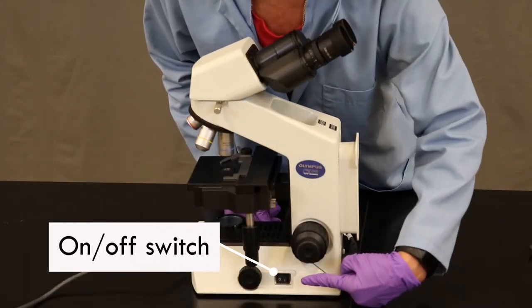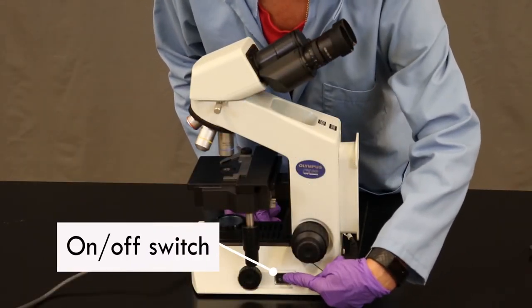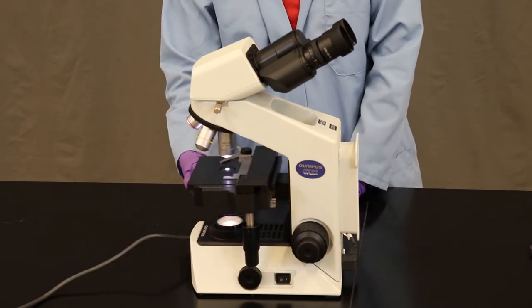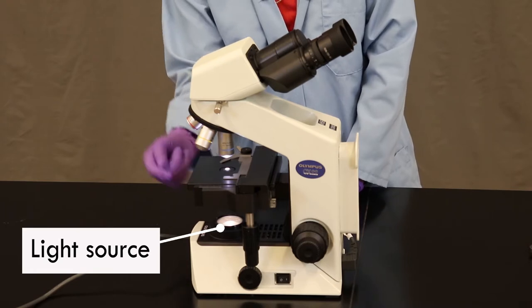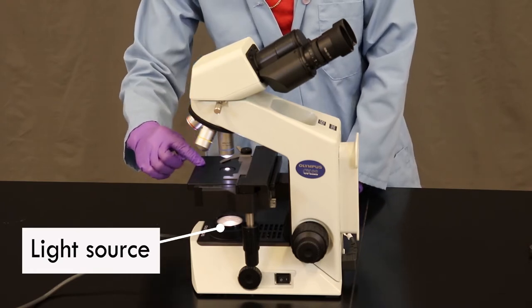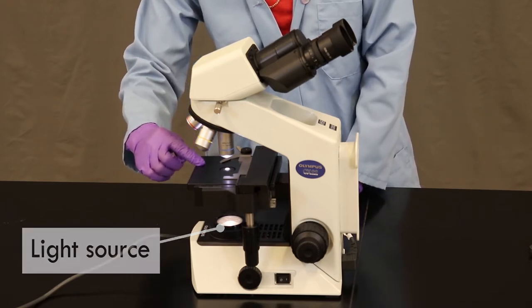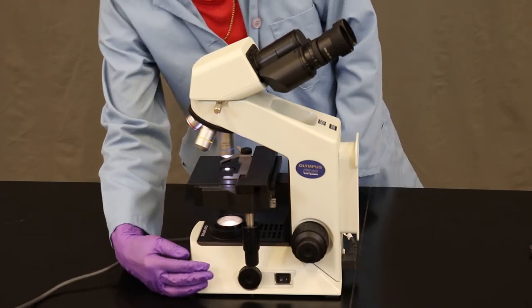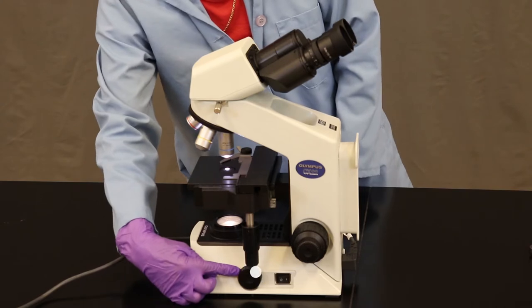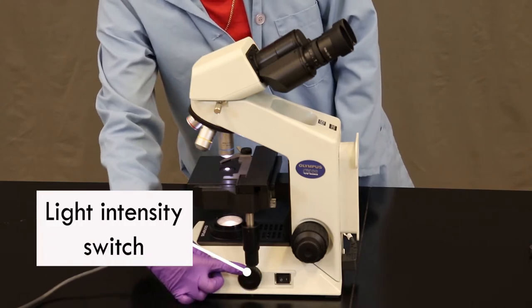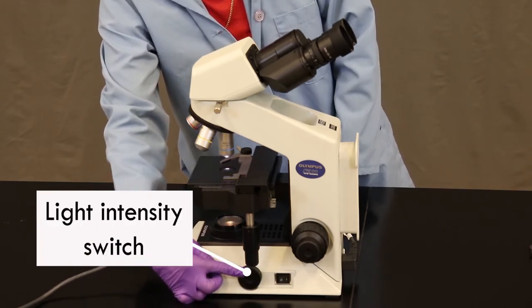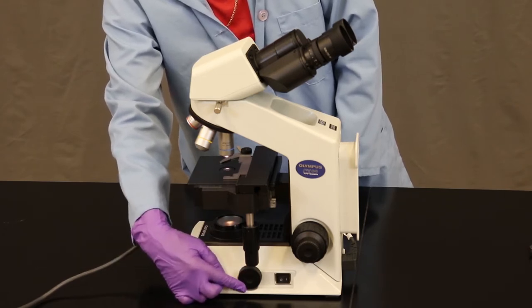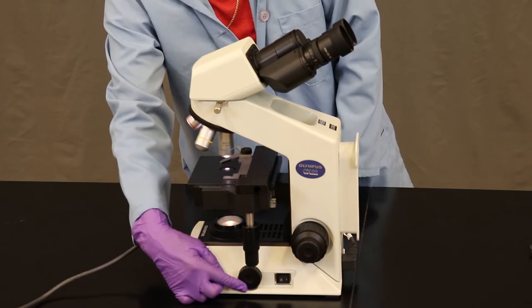It has an on-off switch right here. I just turned it on and when I turn it on, the light comes on and puts light up to the stage where the slide is going to be. We can control the intensity of the light with this knob here. It's a dimmer knob that can start reducing the amount of light that reaches the slide, or in the other direction increasing the amount of light that reaches the slide.